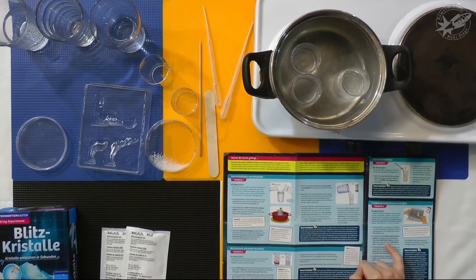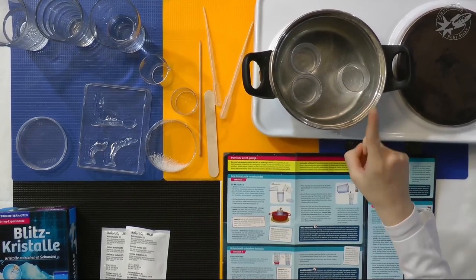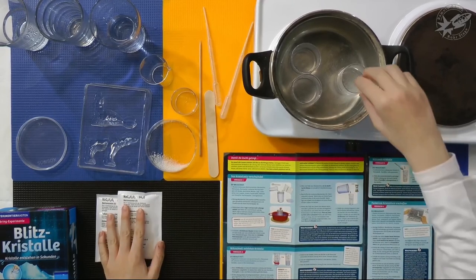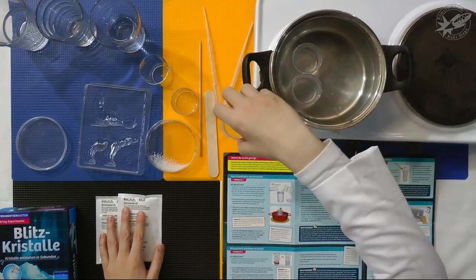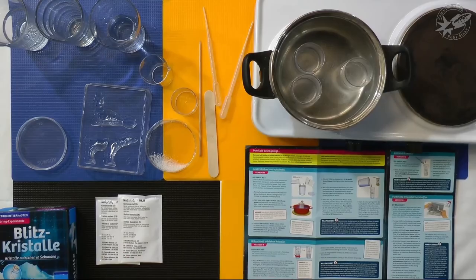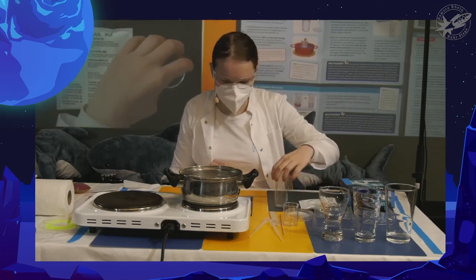Mix with 5 ml of distilled water. For experiments 2 and 3, which I'm trying to carry out, I'll use different amounts of water. I already prepared a 10 milliliter solution before the start of this show. It is simmering slightly at the moment. And because I will need it for this experiment, I'll leave it in here for now. It crystallizes very quickly.